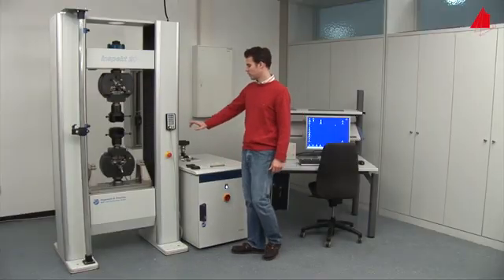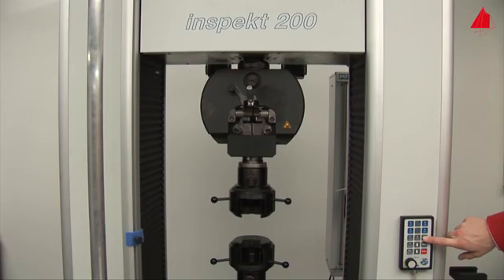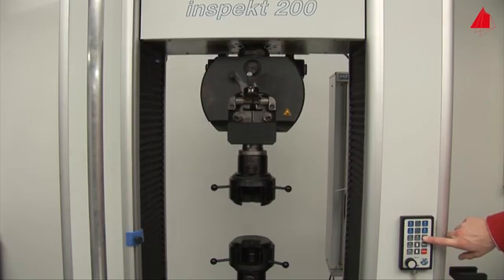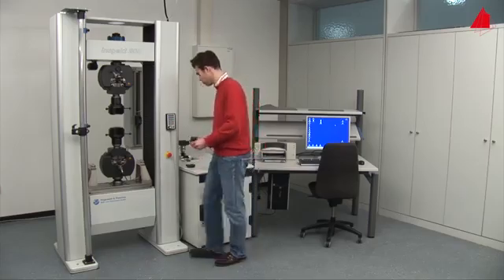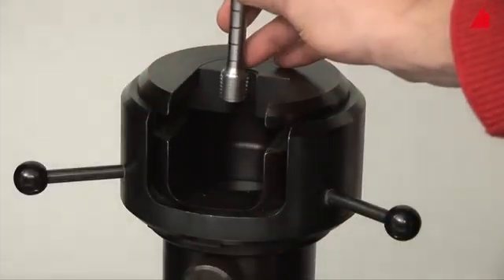Using a hand control, the tester moves the upper crosshead into its correct starting position. Now he can place the threaded ends of the test piece in the lower and upper grips of the testing machine.